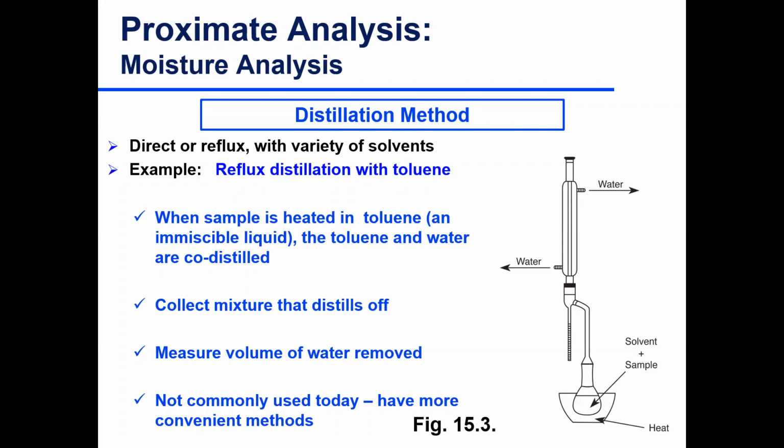Well, it's a volumetric measurement. Not commonly used. Why is it not commonly used? Because it takes time. But again, if you're in a situation where you don't have money, it gets you a number and it gets you an accurate number.